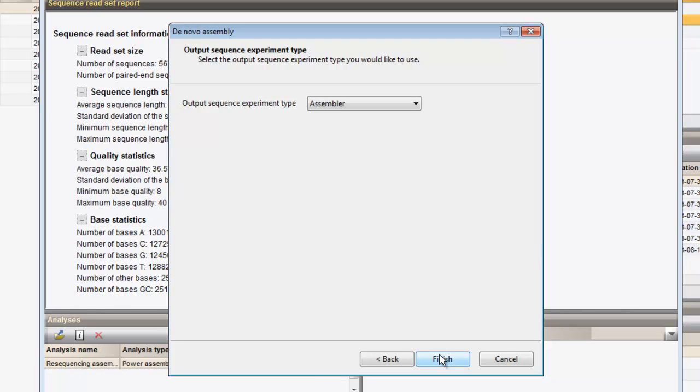The de novo contigs will be saved to the same entry as the initial sequence reads set. Only the sequence type where the concatenated contigs should be saved to needs to be specified. For this example, we will save the results to the experiment type de novo genome.